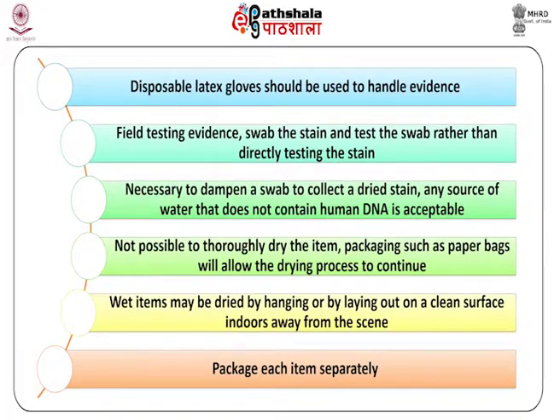If the stain is small, it should be tested in a lab rather than in the field. When it is necessary to dampen a swab to collect a dried stain, any source of water that does not contain human DNA is acceptable. Sterile water, distilled water, saline solution and tap water meet this definition. Document which type of water is being used.